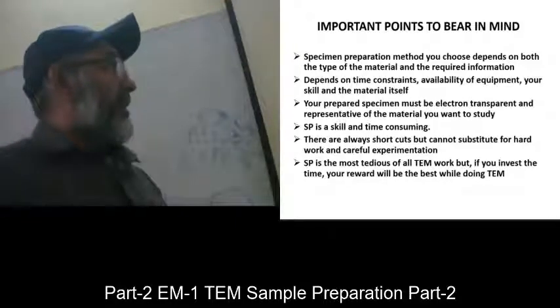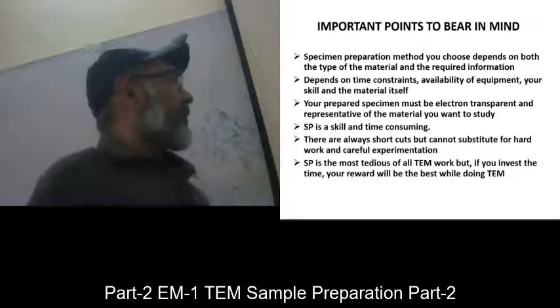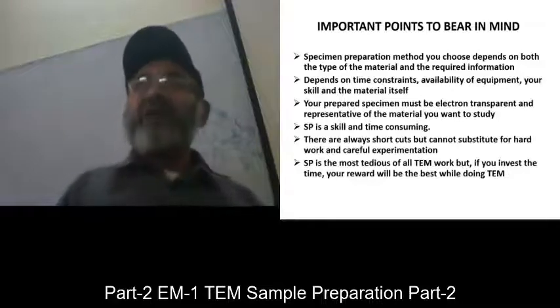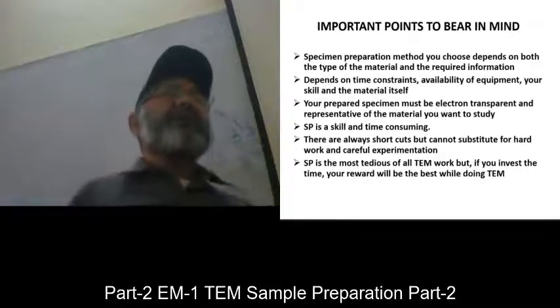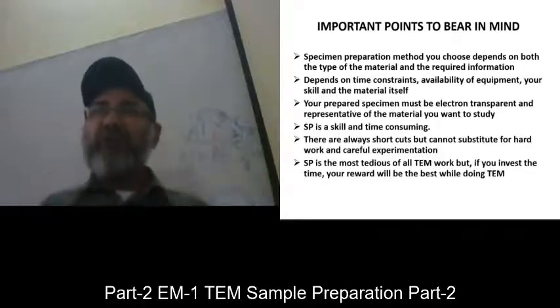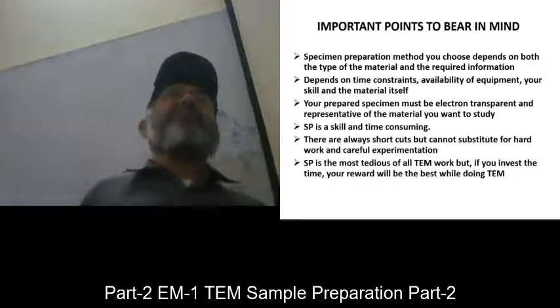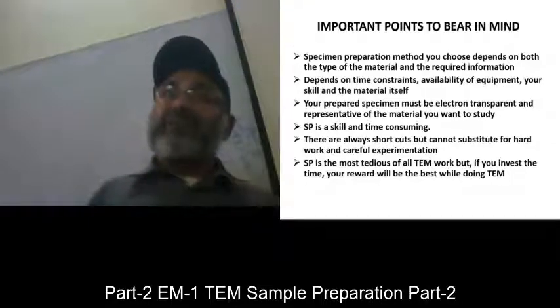So, sample preparation is a skill and time consuming. There are always shortcuts, but they cannot substitute for hard work and careful experimentation. Shortcut is always a wrong cut. So if you are doing something, then do it from the core of your heart and work hard so that you lead the field. If you adopt shortcuts, then many flaws will appear in your work and you can never become a leader in the field.